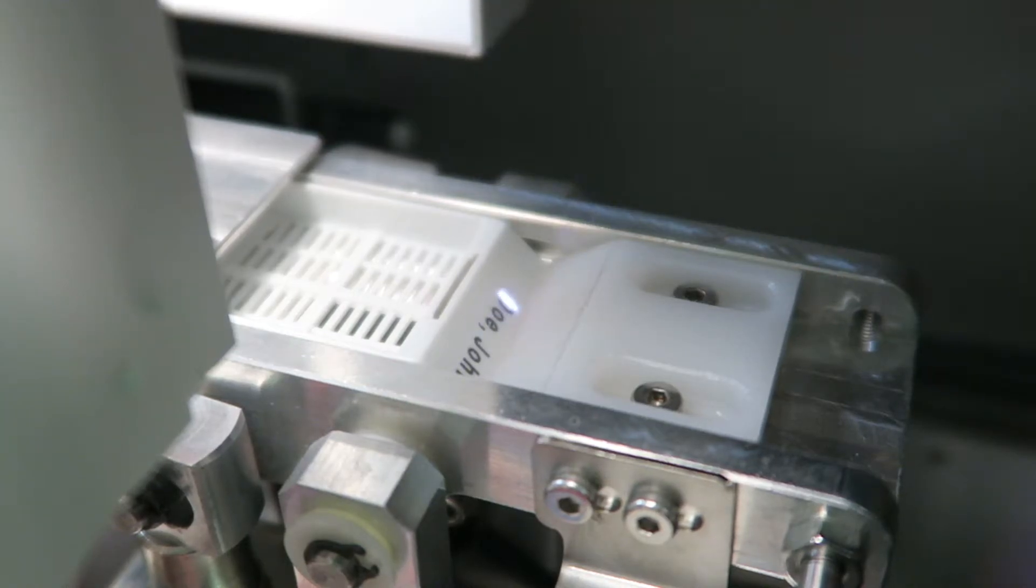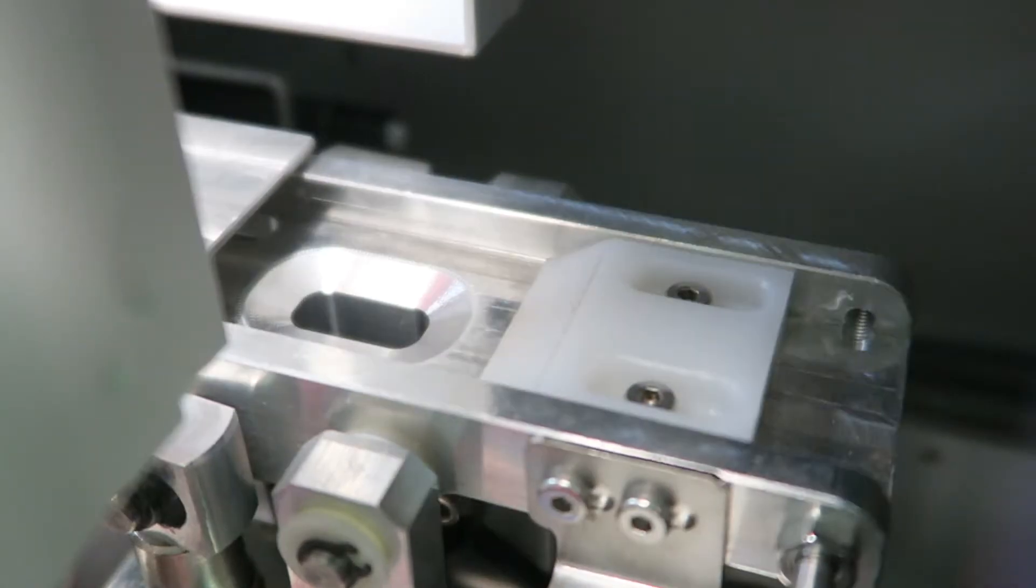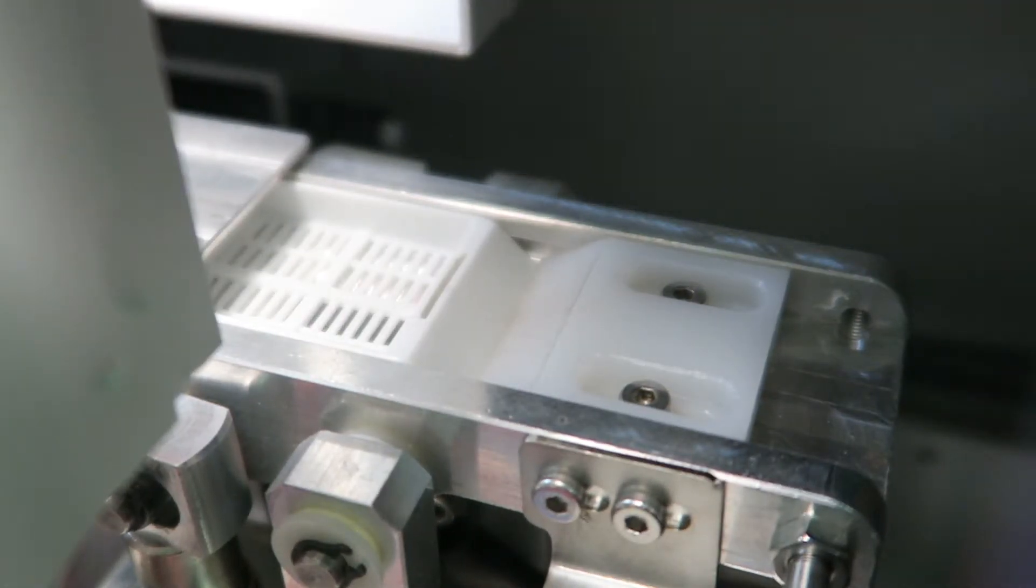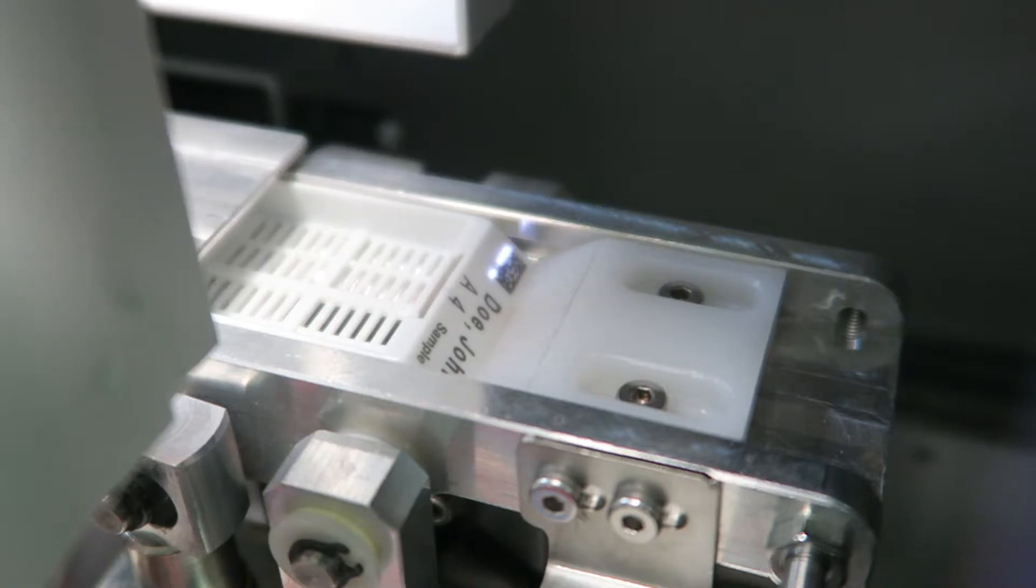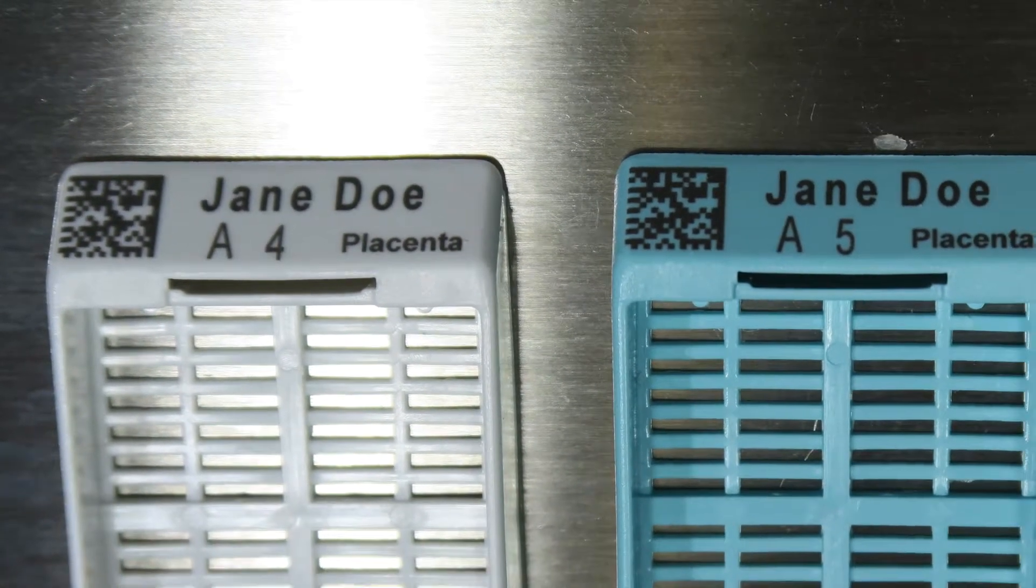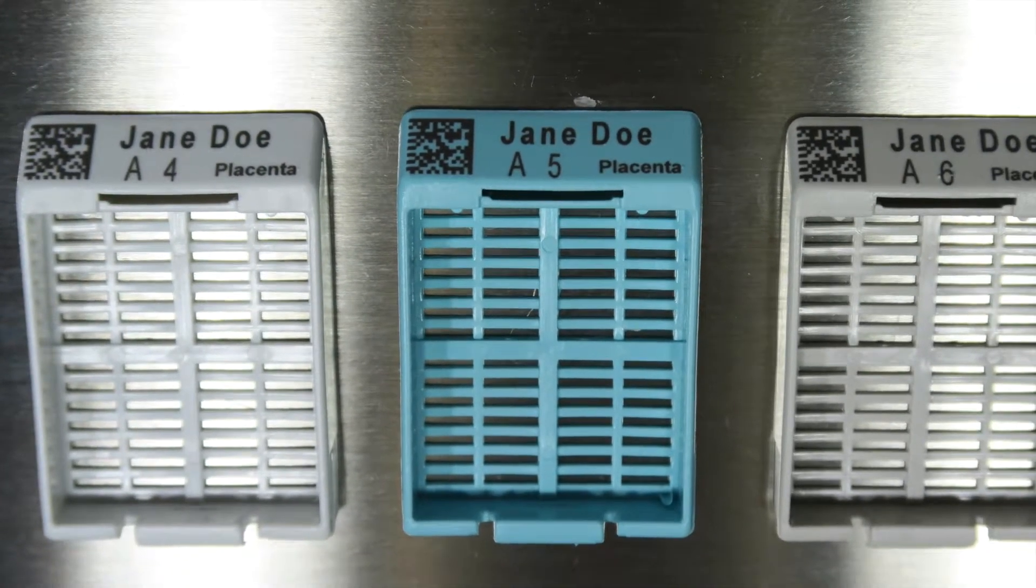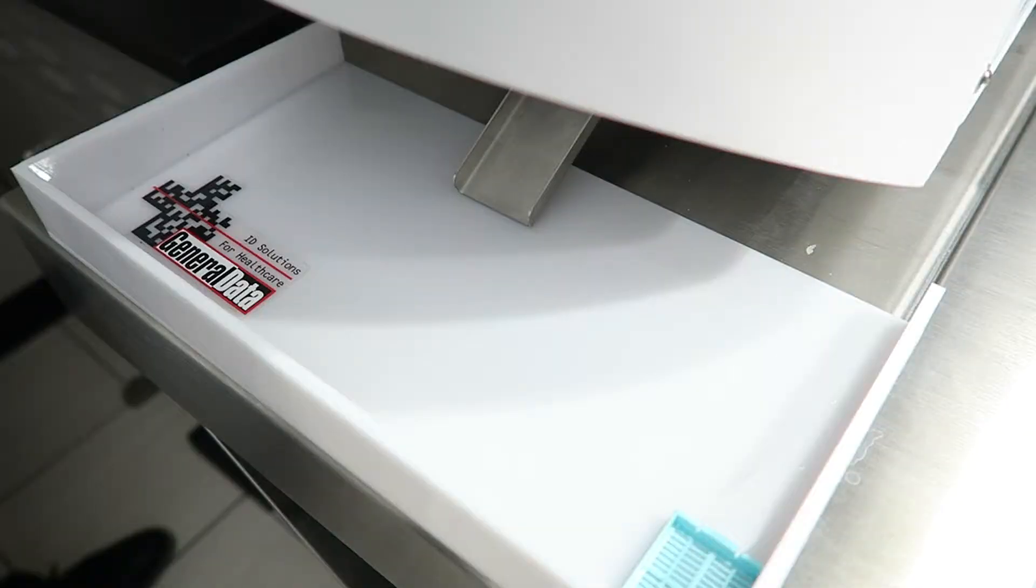The LaserTrack PH6 prints tissue cassettes using our innovative laser technology that creates the precise clean edges needed for scanning and decoding the small 2D barcodes used on tissue cassettes. Cassettes printed using the LaserTrack PH6 are reported to have a 99.5% scan rate throughout the tracking process.